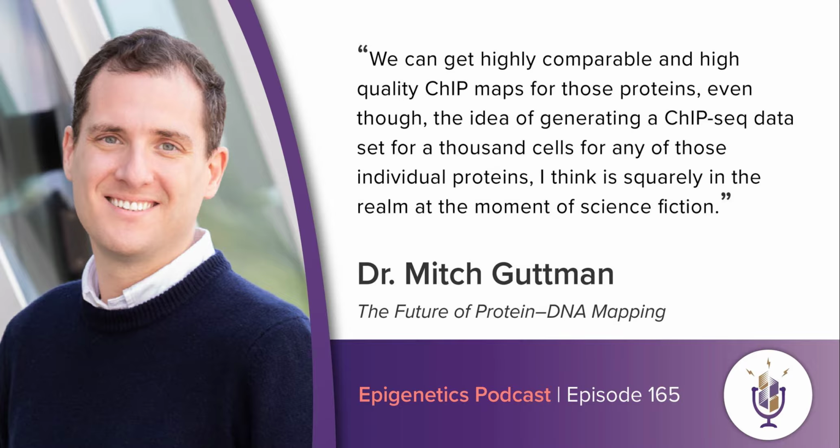Even for the same protein, if you have two antibodies that have different affinity, you'll have differences in the profiles. But at least at the level of a lot of the technical variability, the ability to do them together really does reduce a lot of that noise.